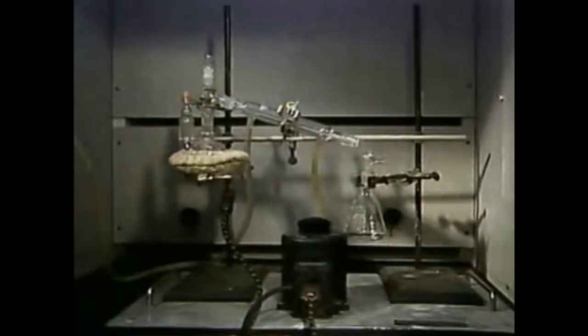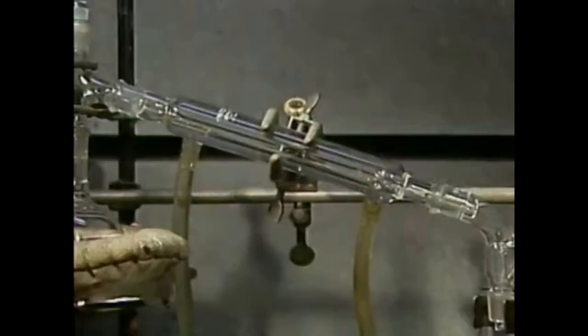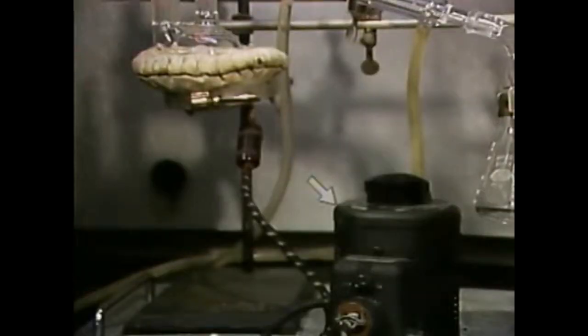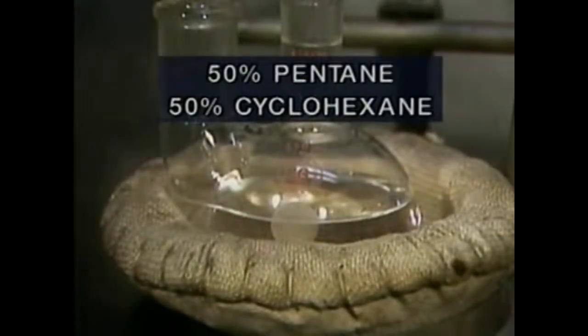In order to separate the components of a liquid mixture, a distillation system must have a container for the liquid mixture, a condenser. This one consists of an inner tube for the vapors and an outer tube with cooling water running through it, a receiver to collect the liquid leaving the condenser, and a source of heat. We'll use an electric heater. The liquid mixture we'll use consists of 50% pentane and 50% cyclohexane.